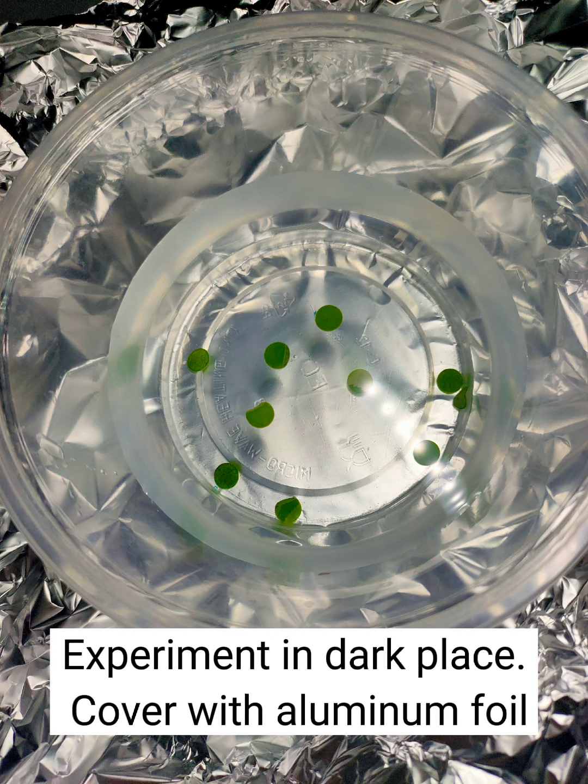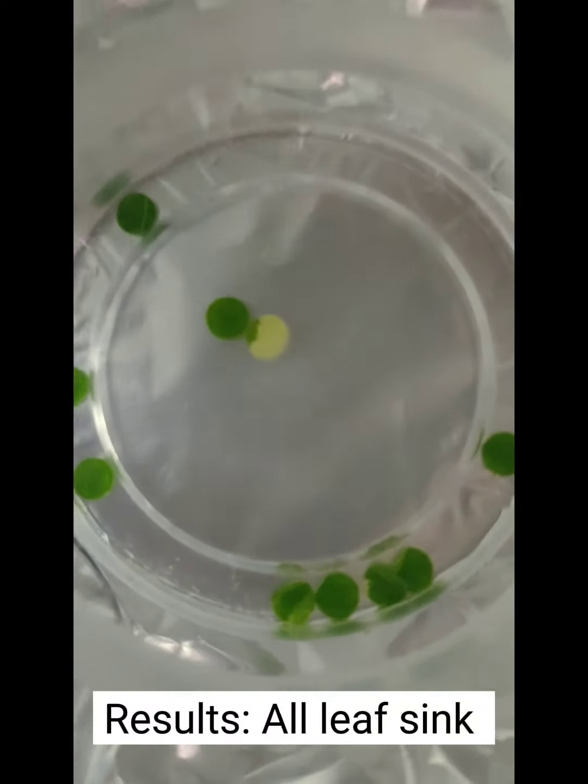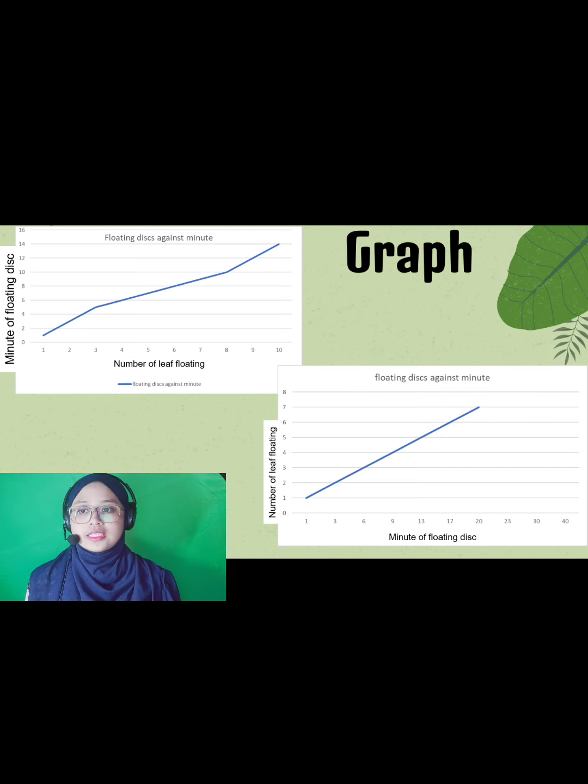So we continue in a dark place, covered with aluminium foil, so we can see our leaves sink in the container. In the graph, we can see the difference. The upper is from the 3 cm light from the container, and the lower is the 10 cm light from the container. So we can see at 3 cm, the graph is linear, where all the leaves are floating, while at 10 cm we have four leaves that do not float but sink to the bottom after 40 minutes of observation.